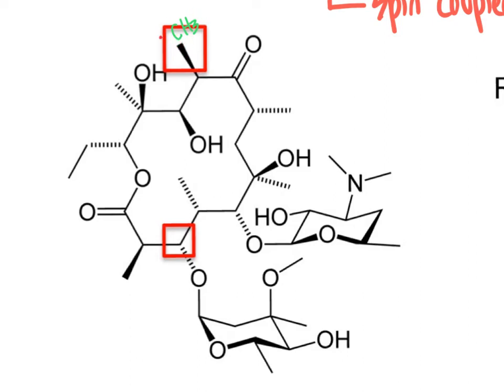So we expect this to have free rotation around this carbon-carbon bond, and hence those 3 protons to be interchangeable, meaning that they are all equivalent to one another. They are indistinguishable in the eyes of the NMR spectrometer. So they are expected to have one chemical shift, and then we need to sort out what protons we would expect those methyl protons to show correlations to in the COSY experiment.